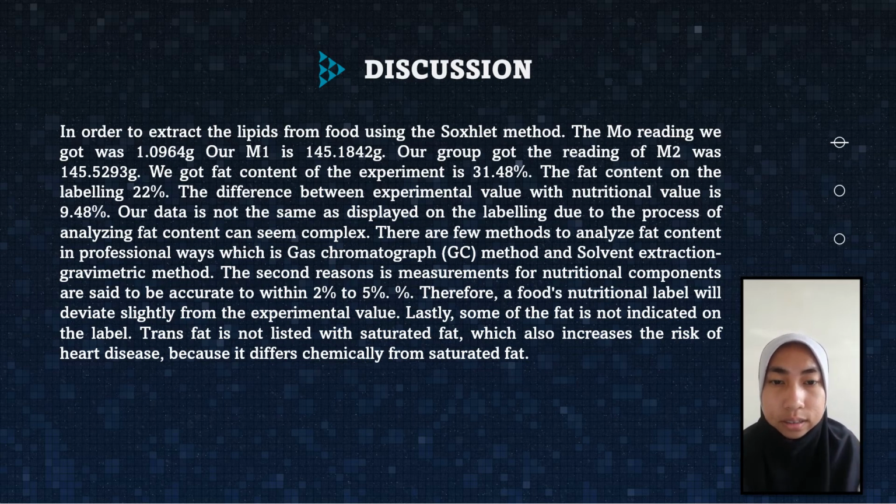So the food contains 3 times as much unhealthy fat as is shown on the label. Thus, this can be used to support our result that there may be fat in food that is not included on food labels, which is why the fat content in our experiment was higher than the fat content on the product label.